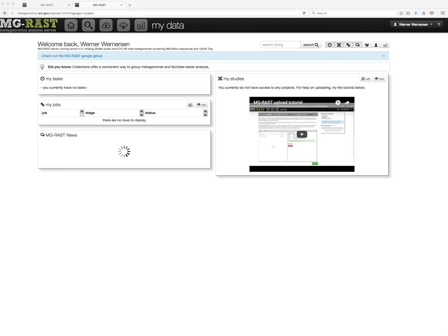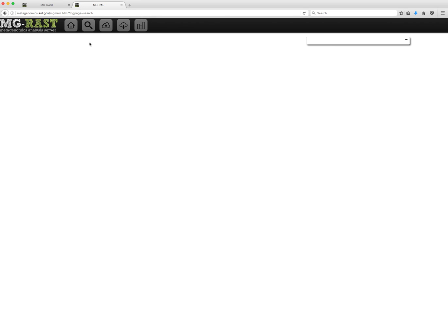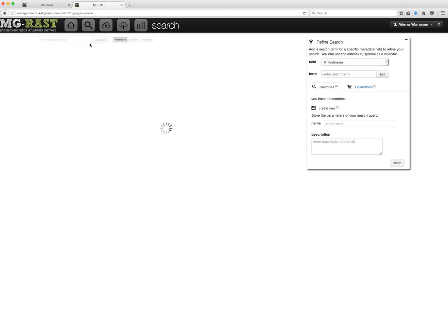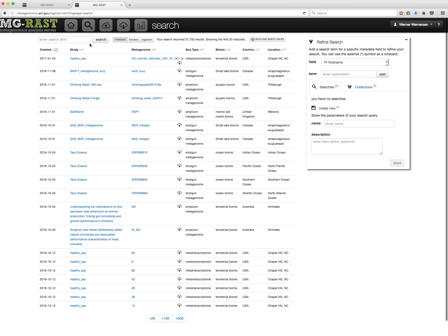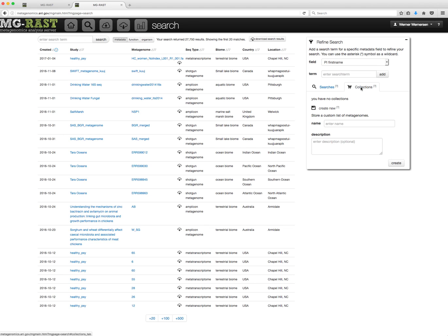You can get to the search page by clicking on the magnifying glass icon in the menu. The collections tab is located on the right. Collections are indicated by the shopping cart icon.